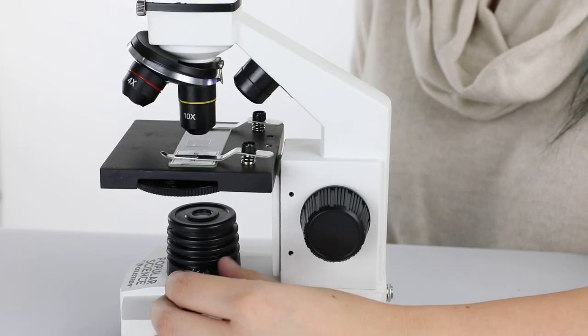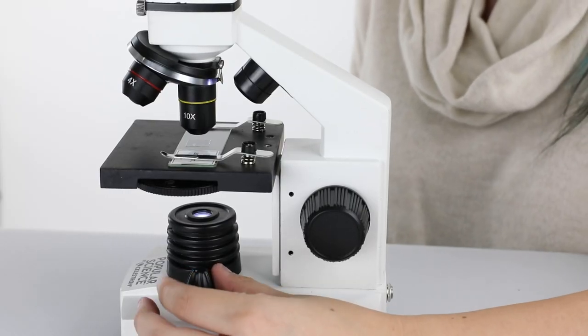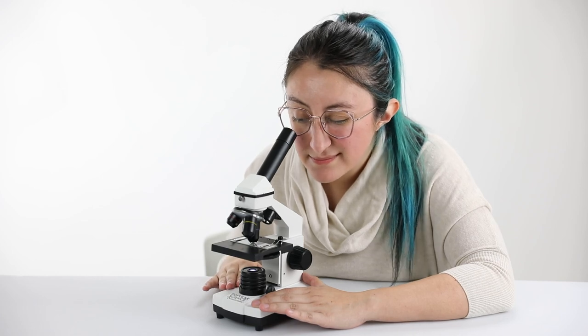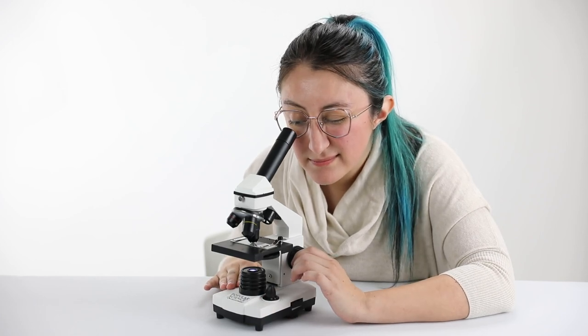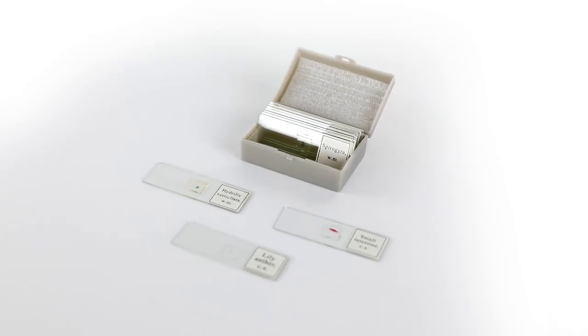Built-in adjustable upper and lower illuminators help you get a great view of any specimen, and you can get started observing right away with 10 prepared microscope slides.